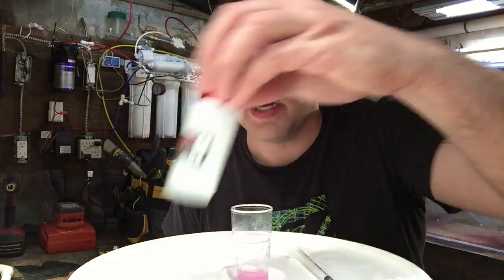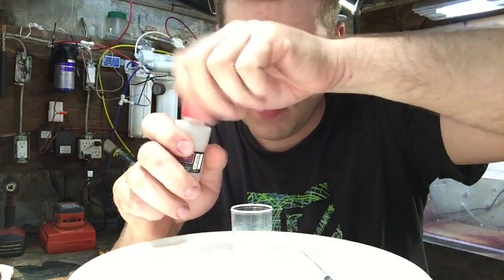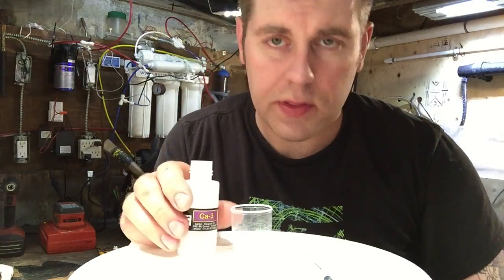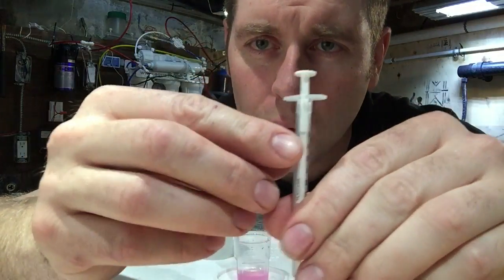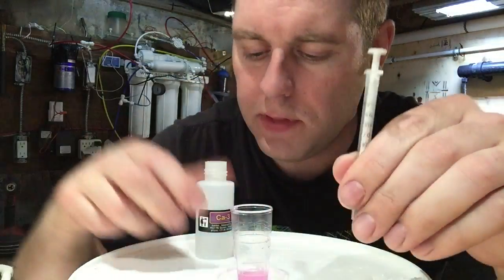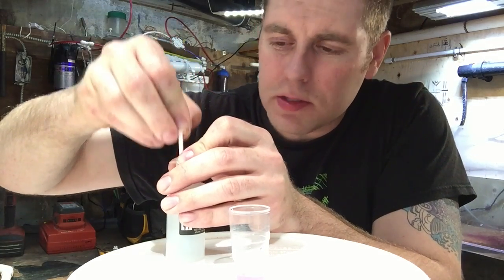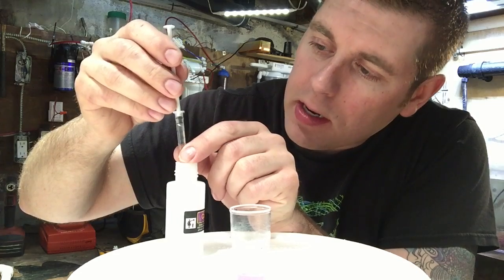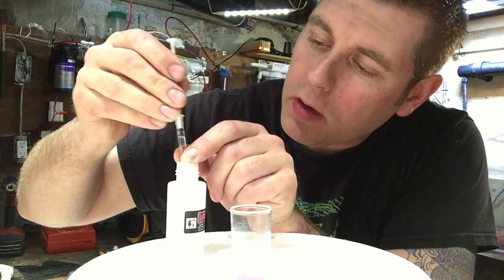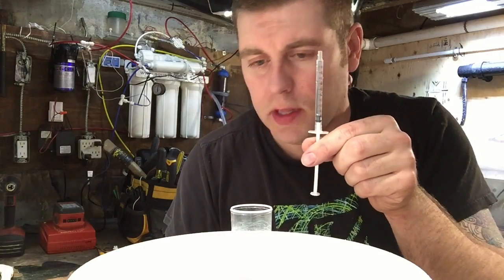So the next thing you're gonna do — I'm just gonna move my tank water out of the way. Take your CA-3 solution out of the box and put the cover to the side. You're gonna take your syringe again and fill it to the one milliliter mark of this solution. Put it in, give it a couple shots to get the air bubbles out, fill it past and then push the plunger right to the one mil mark. Now it's full right to the one mil mark. Set it aside so we don't spill it.